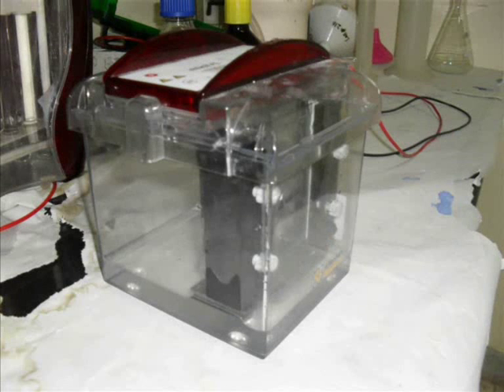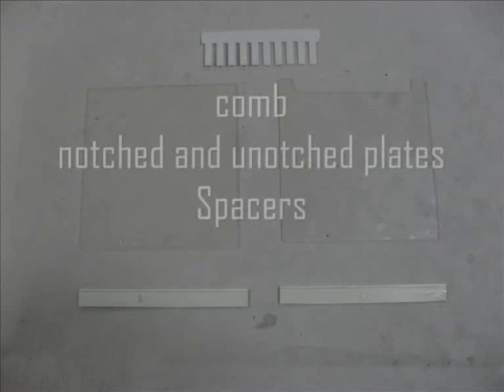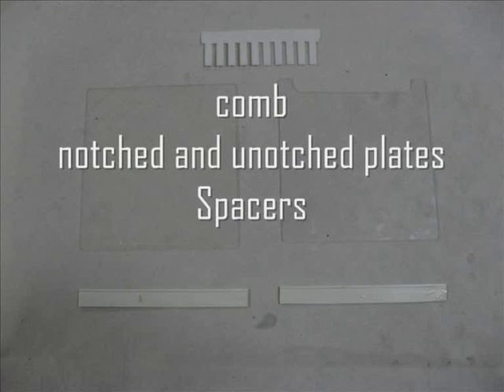It is a gel electrophoresis instrument which is used for SDS-PAGE. The parts of the gel electrophoresis instrument are clamp, comb, spacers, notched and unnotched plates.